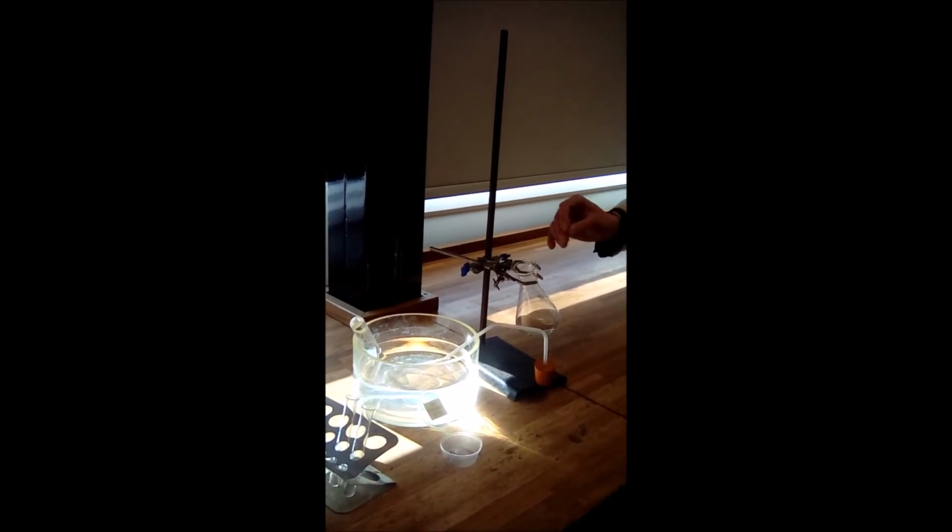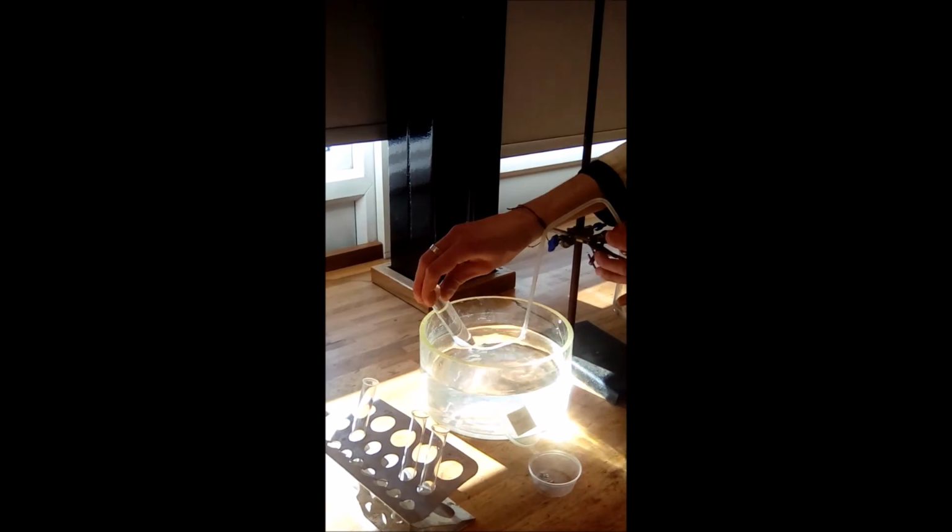So today we're going to do our first experiment. We're going to test 4 experiments and tests for gas. So the first experiment we're going to do is a test for hydrogen. So the experiment they suggest is you put hydrochloric acid in here, and then we put some magnesium into the hydrochloric acid, and then that will react, releasing hydrogen.